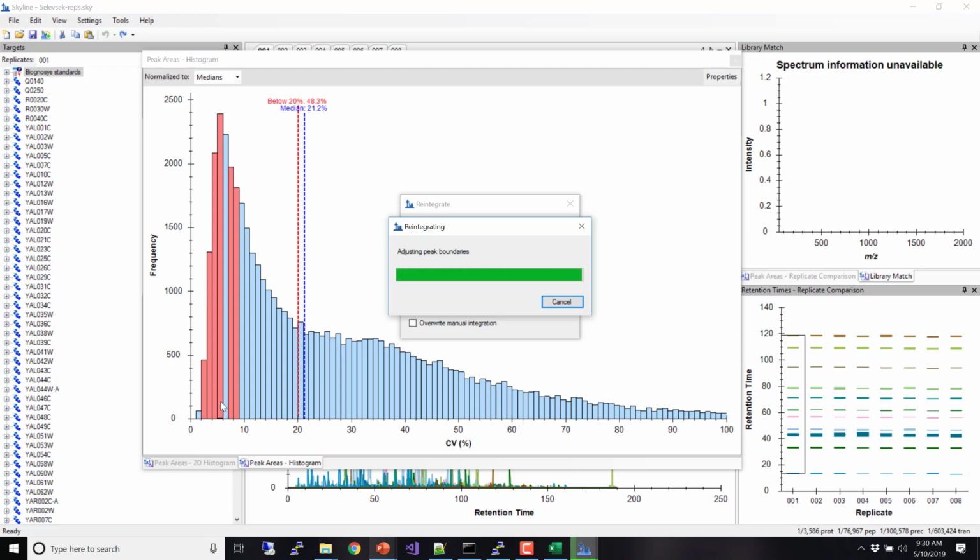When it's this big, I don't really see the point. I would want to get down to manual integration. I want to get down to less than 1,000 peptides. But manual integration and manual checking, if you're going to report things or you're going to come up with targets for your next level, I would say don't just do all the statistics and walk away from your data set.